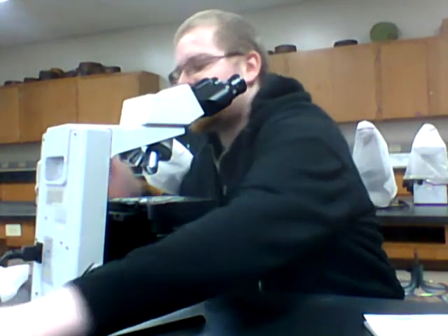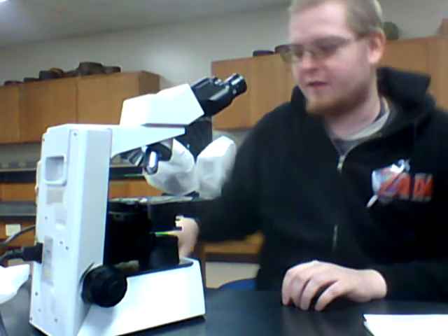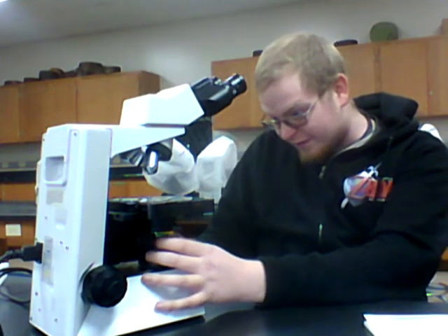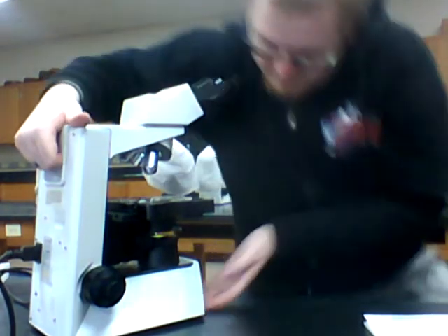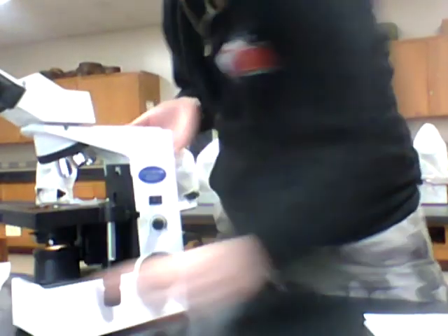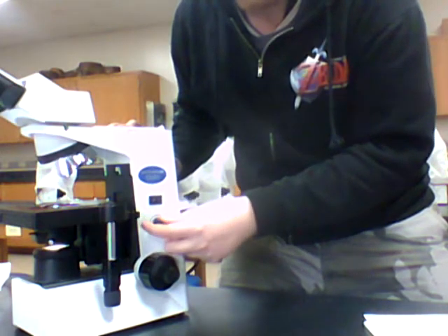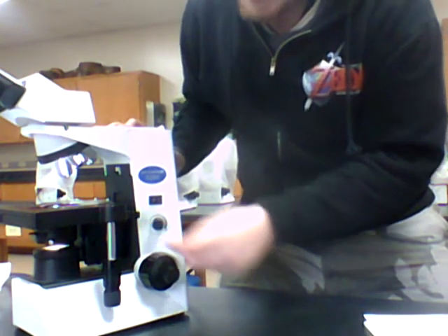Then you plug it in. I can't tell you how many times I've had this problem — some people don't know how to plug in a microscope. The outlet is actually right here. Sometimes you don't even see the light on. Well, there's a turn-on switch right here. So now you should see the light on. If you do not see the light on, there's a knob. Here's the turn-on switch — turn it off. Here's the knob that will basically set the brightness of your light source.